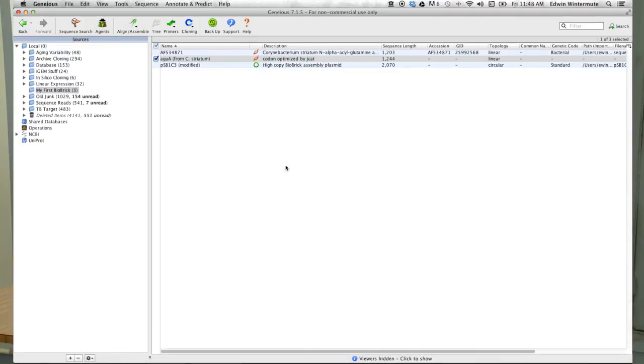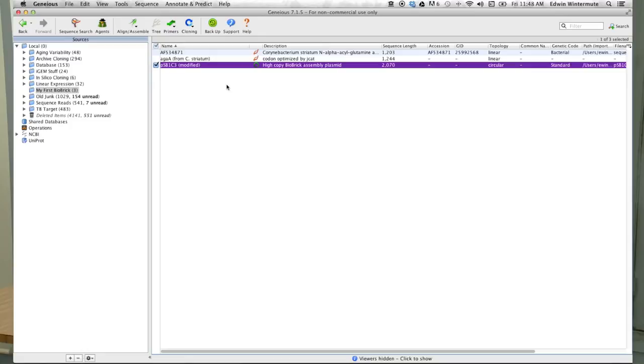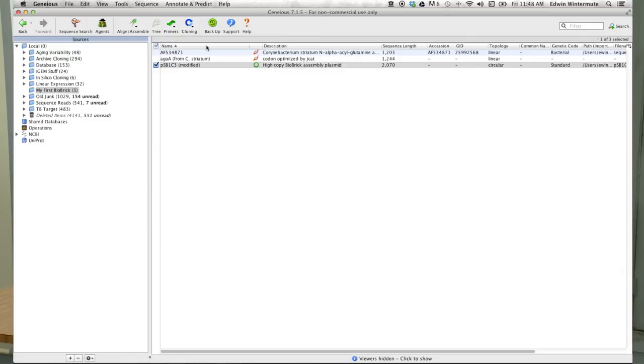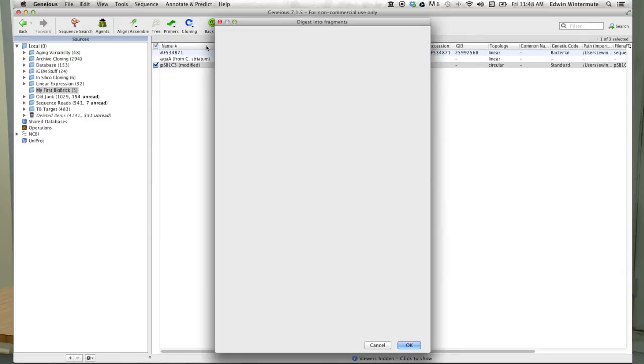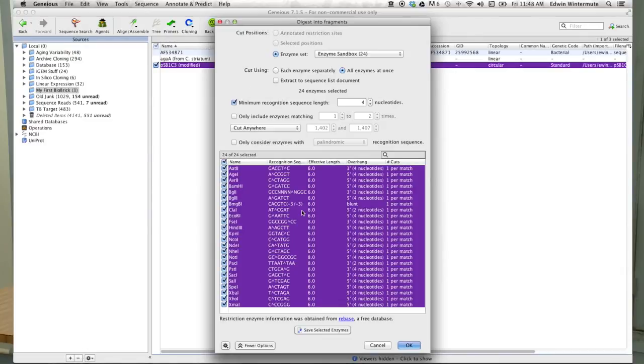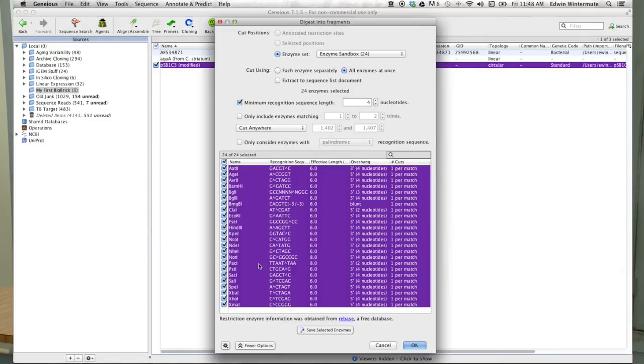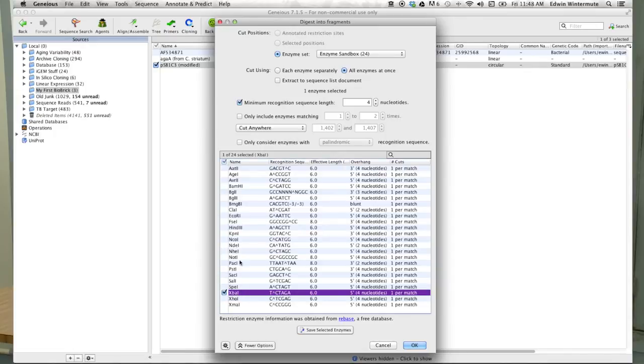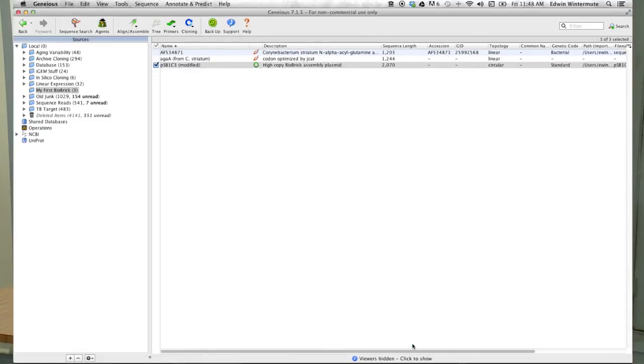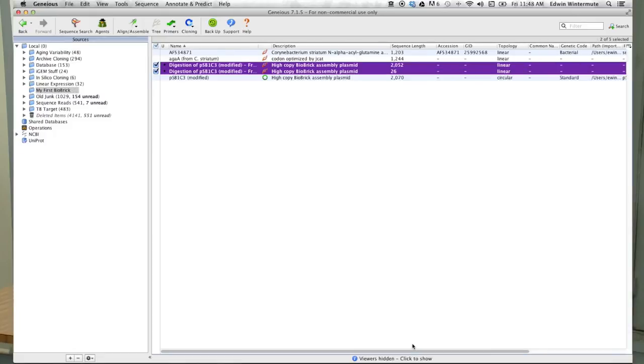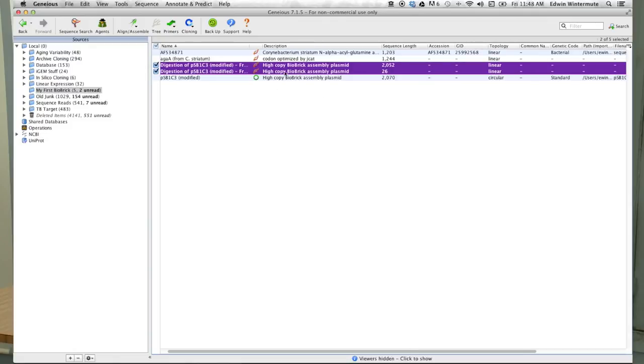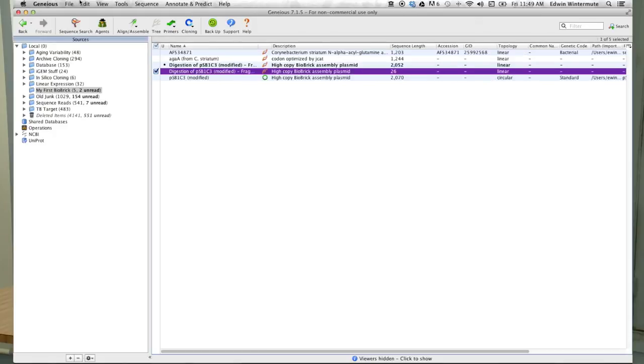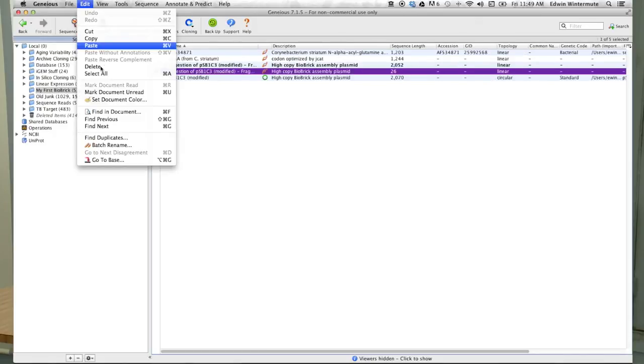That's it - our DNA sequences are designed and ready to clone. Let's go ahead and clone them in silico. I will start by selecting the PSB1C3 vector, go ahead and go to the cloning menu and say digest into fragments. We will digest this vector with the standard biobrick cloning enzymes XbaI and PstI. Alright, looks good. Here we have our digested fragments. I'll go ahead and delete the small fragment since we're not going to be using that.